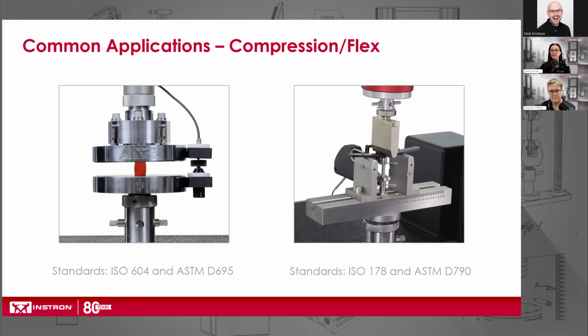So for ASTM D695 and ISO 604, which are the two most important compression testing standards for plastics, those two do require compression platens, whereas the upper platen can be a spherical seated platen to allow for parallelism to be maintained throughout the entire test.